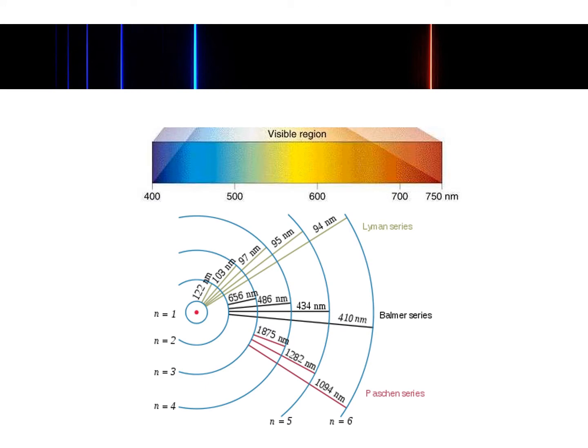Okay, so once we've ionized our sample, you've probably done this kind of stuff already with the X-ray techniques. You've done X-ray techniques? Yeah, so this is the idea with the optical technique. Basically, your sample goes into this plasma, and then we just look at the light coming off that plasma. Say this is the nucleus of an atom. Okay, these are electron shells, and if you're an electron completely outside of this, you're ionized. Okay, but not all of the samples are completely ionized. Some of the electrons are only excited up to different shells. Okay, and when they drop back down into the shell that they should be in, they release a photon, and that photon is wavelength specific to the energy gap between the different shells.